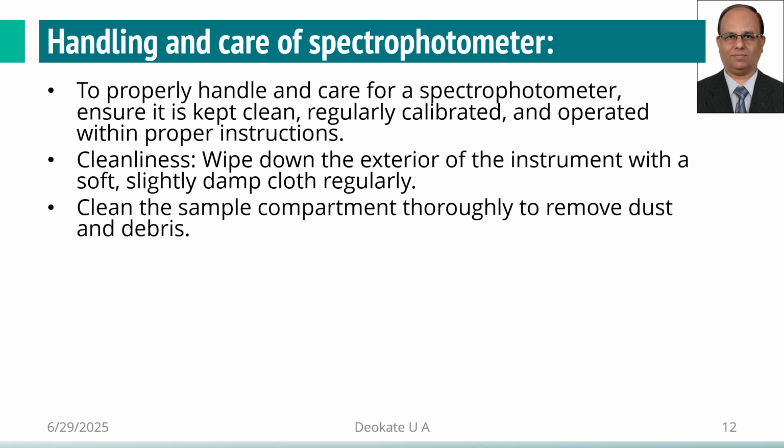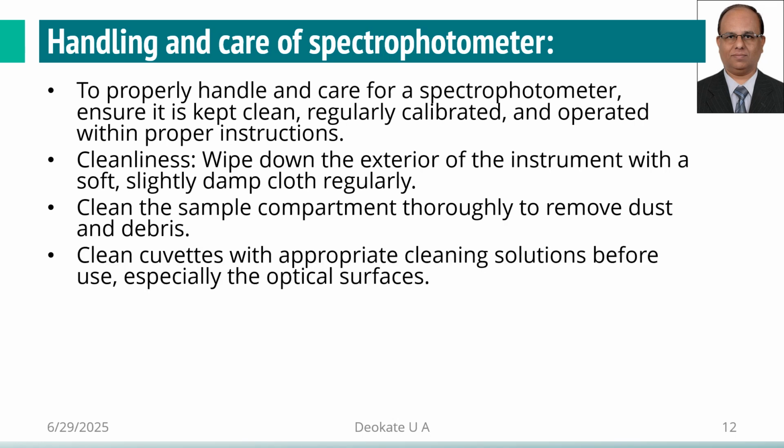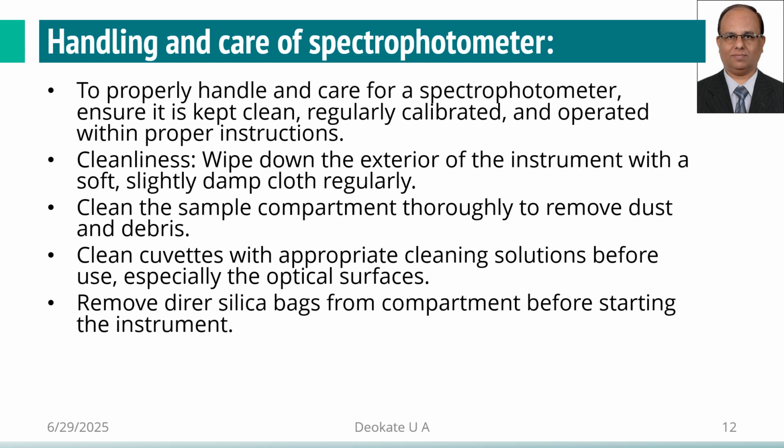Clean the sample compartment thoroughly to remove dust and debris. Do not spill any chemicals or solution into the sample compartment, as it will cause corrosion. Clean the cuvette with an appropriate cleaning solution before use, especially the optical surface. I will focus on the cuvette in the next slides. Remove dried silica bags from the compartment before starting the instrument.